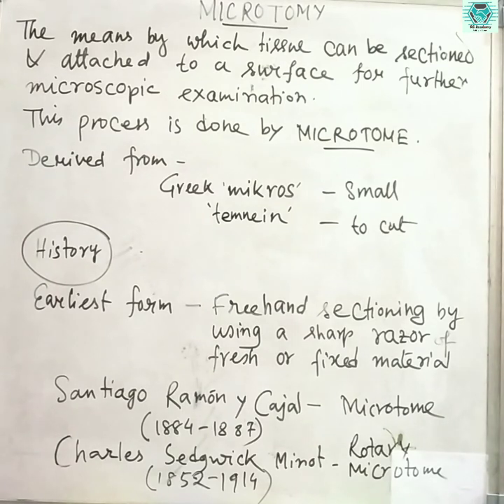Today I will discuss microtomy. So, many living things are extraordinarily beautiful, isn't it? But some things are microscopic, we cannot see them. So to get a privileged view, this may be enhanced by looking inside. And it can be done by seeing under a microscope.